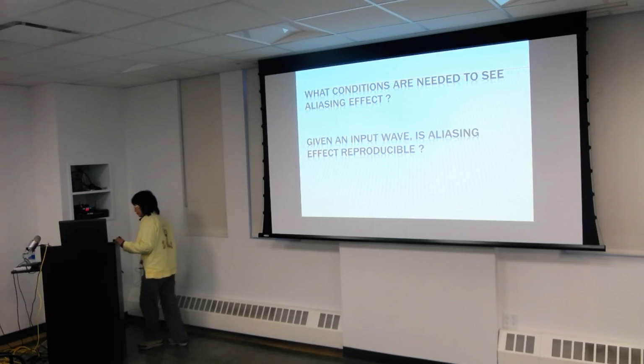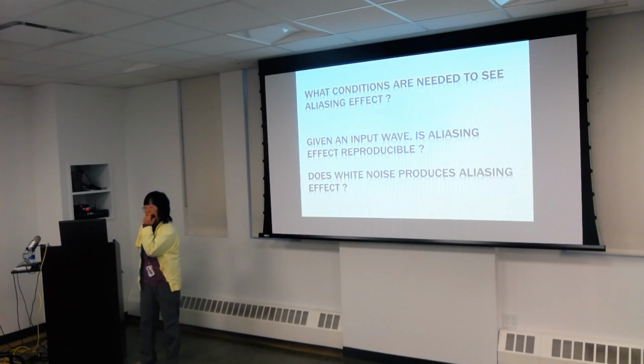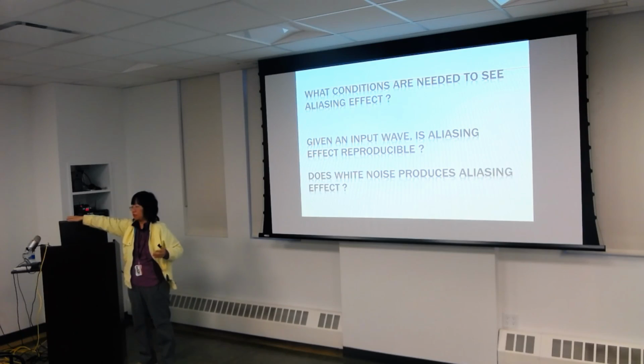All right, so now the last question. I was wondering about this as well. I'm not quite sure that I have the right answer. Now we talk about information coming in with signals, and you have the aliasing effect that folds back into the frequency space that you look at. What happens to the noise? Say, for example, I have a sharp noise or white noise, which is flat all the way to infinity. What happens to the aliasing of that? Where did that go? I don't have a real answer for that, and I'm open to suggestions. So, what do you think?